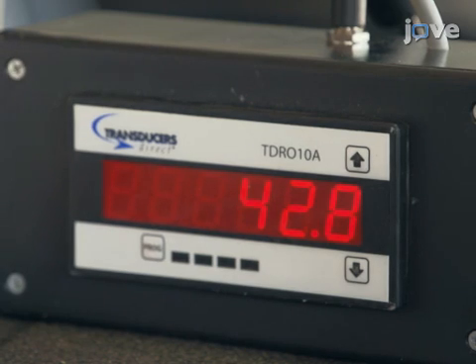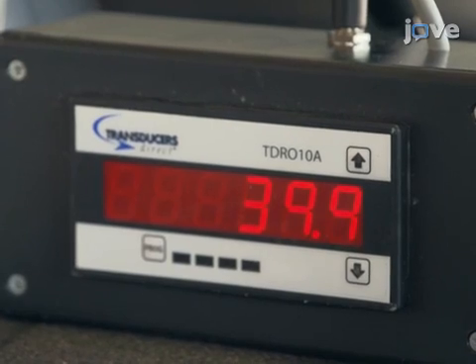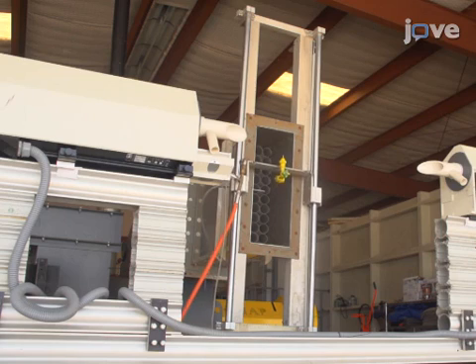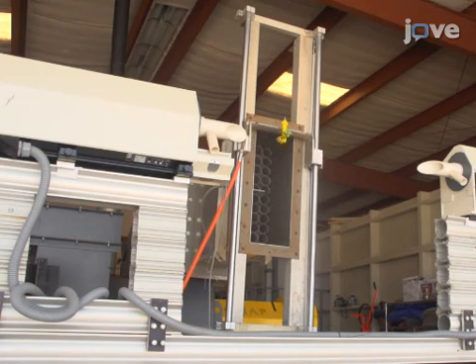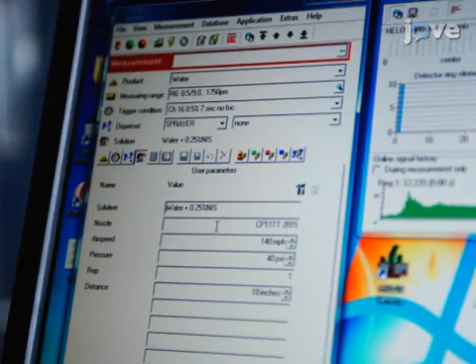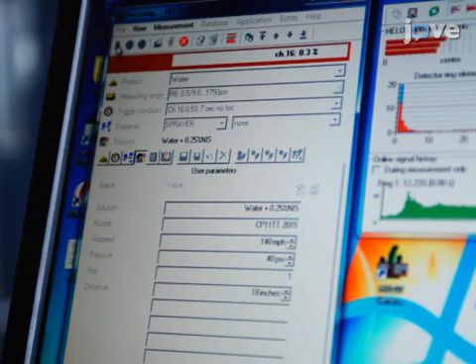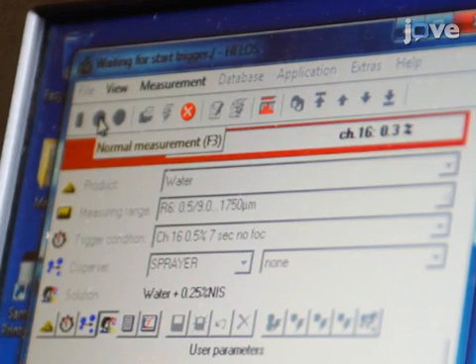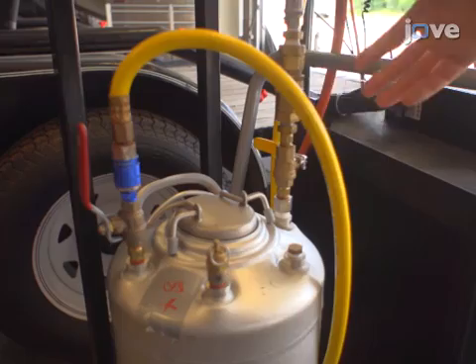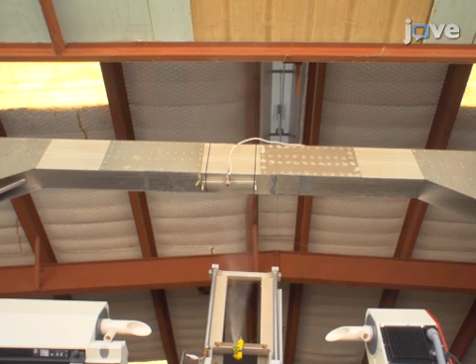Use the readout from the pressure gauge on the nozzle body to verify the spray pressure. Before initiating a measurement, place the nozzle at the top position of the traverse. Ensure that all experimental parameters are entered into the diffraction system software and initiate a reference measurement. Now initiate the measurement cycle and when the system is ready, open the liquid feed valve on the pressure tank.